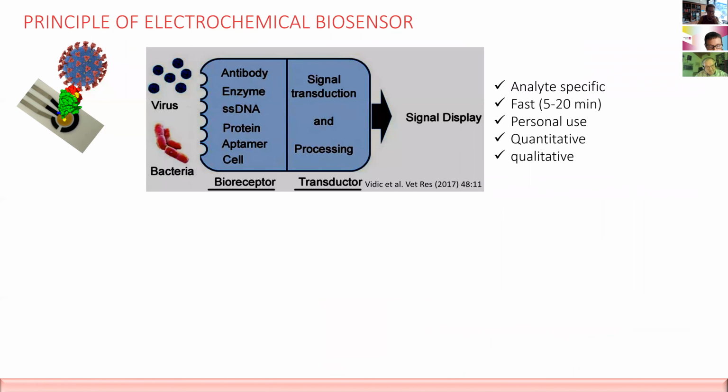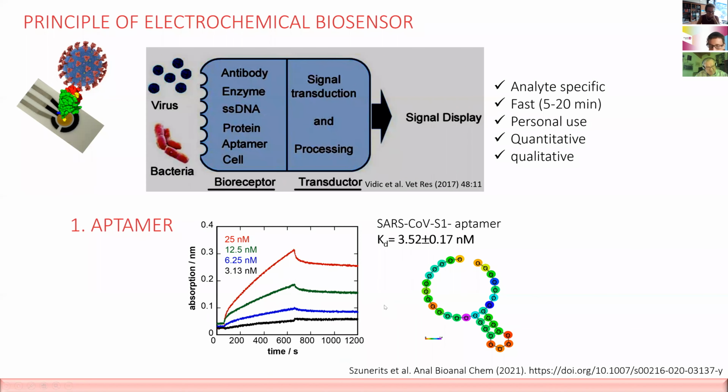So before I had talked about an antibody ligand for the E. coli. Here we opted for 2 different ligands. One was an aptamer. So you see this type of aptamer. We worked together with BioPairs, an aptamer company in the States. And this type of aptamer has a nanomolar KD value for the spike protein of SARS. And this is very interesting. So mostly this aptamer is in the nanomolar range. So you can get this type of profile from ELISA or SPR measurements.